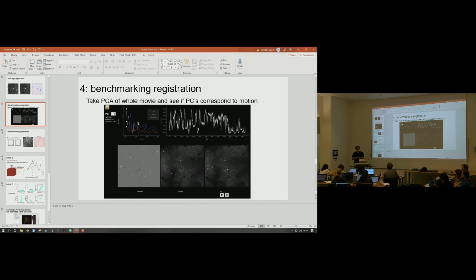So we show a lot of stimuli, coming one after the other, and your transient is always riding on top of some background activity from before, and your stimuli are coming in random order, right? Then you're always going to have this extra noise added to your stimulus response.